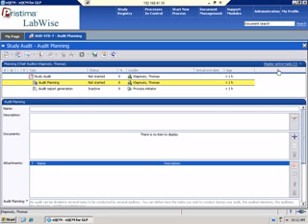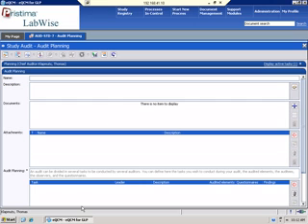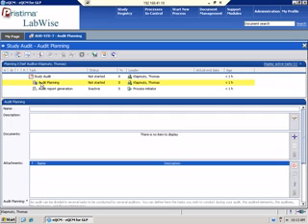And so when you launch the process, you always see the process displayed on top. You could always minimize it and then just use the working screen. But this kind of lets you see what part of the process you're in. And so the study audit hasn't been started. I'm right now in the planning step.